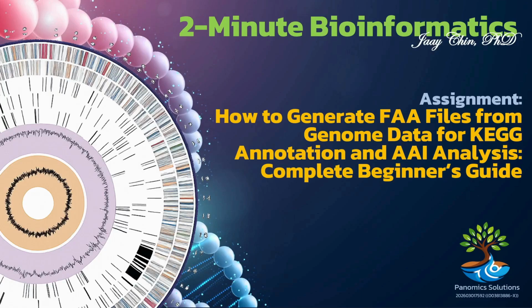In today's tutorial, we will learn how to generate FAA files from genome data, and why this step is essential for downstream analyses such as KEGG functional annotation and average amino acid identity analysis.